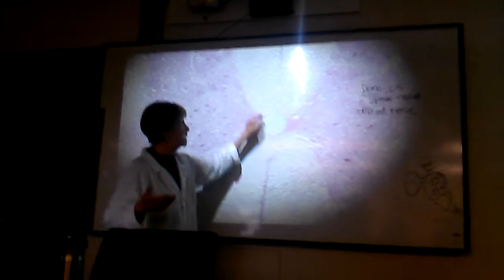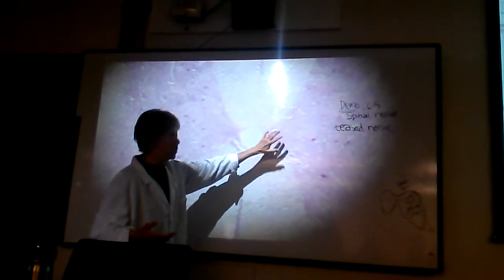Posterior commissure, but we really don't see much of it. And on your slide you might have or might not, but the purple is the gray matter, and so you would see it connecting on either side of the central canal. And I forgot to look and see if we see ependymal cells. Not stained on this one. Sorry, I had to take it out of focus.